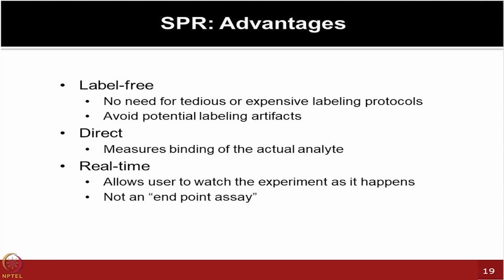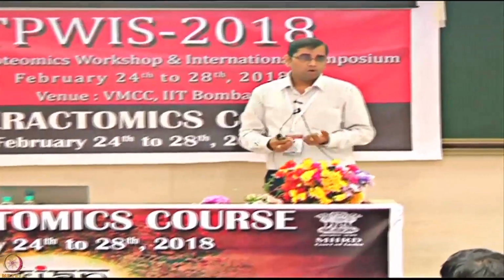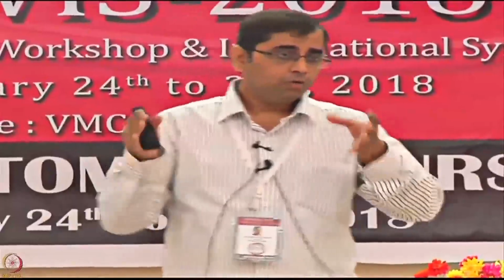Many times we try out different concentrations of different antibodies when we are doing the first initial screening, or you can use different flow rates to try out. So many things you can play with in the initial round of experiments to find out what can be the best condition for your binding to be observed. And now once you finalize those conditions, then you can apply the same in your full experiment with many of the molecules of interest.